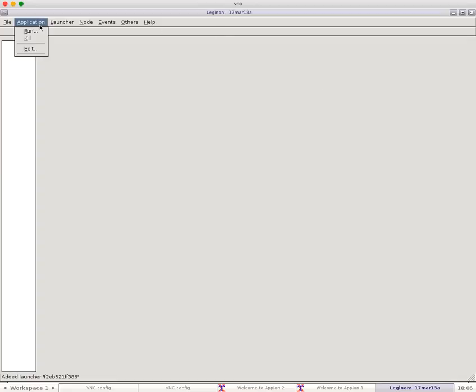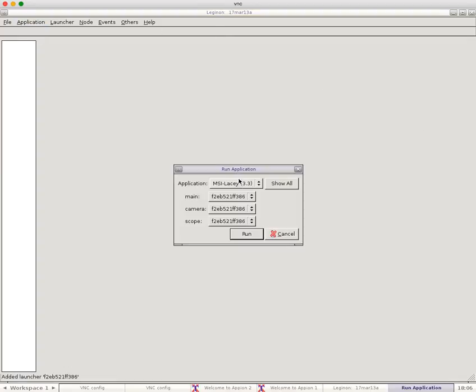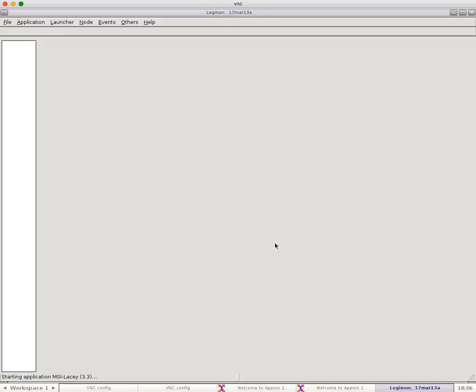And we'll go back to our Legenon window, and now we'll have our MSI Lacy 3.3 available. So we can run that.